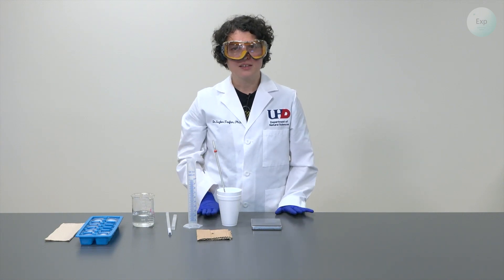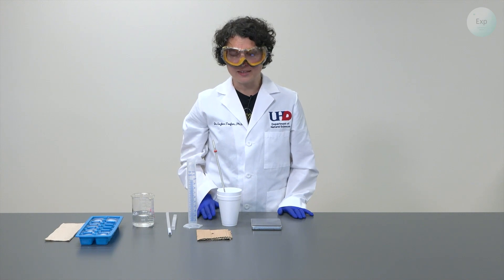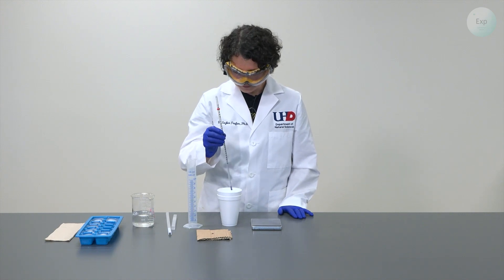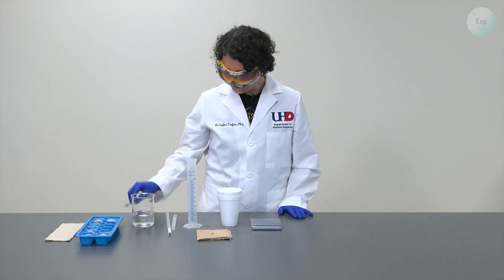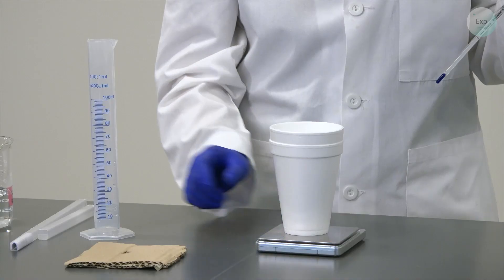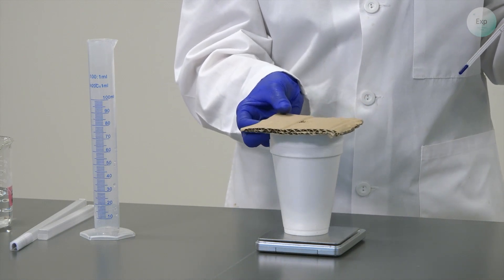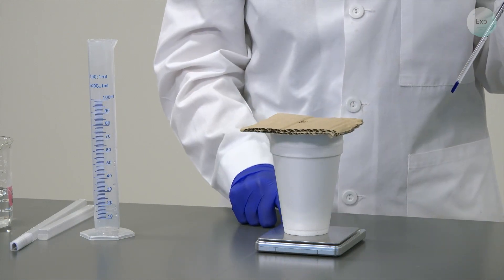Whenever we record temperature using the typical thermometer, we will need to have one decimal place in that measurement. Next, we remove the thermometer, place our styrofoam cups with the water, and now we can add the cardboard lid on top.